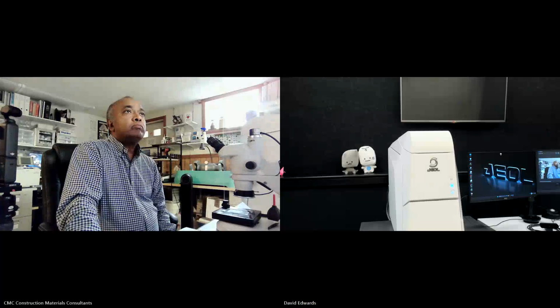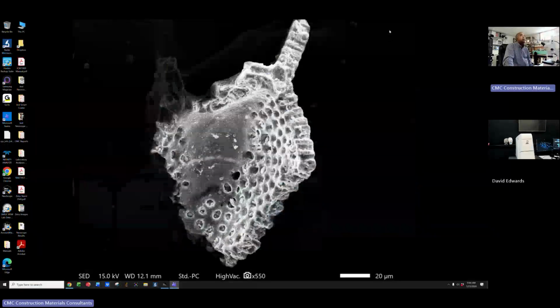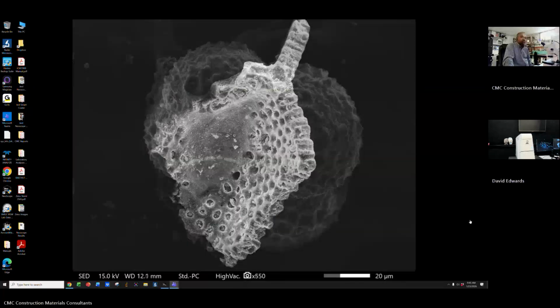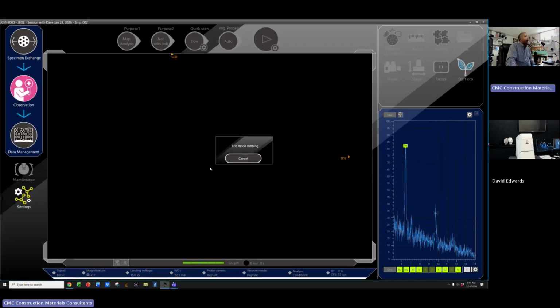There you go. Okay, the whole screen is now shared. So what I was planning to do, Dave, is just go over one analysis and show you the hiccups I'm having step by step. So when I inserted the sample, I'll show you the first issue I'm having.